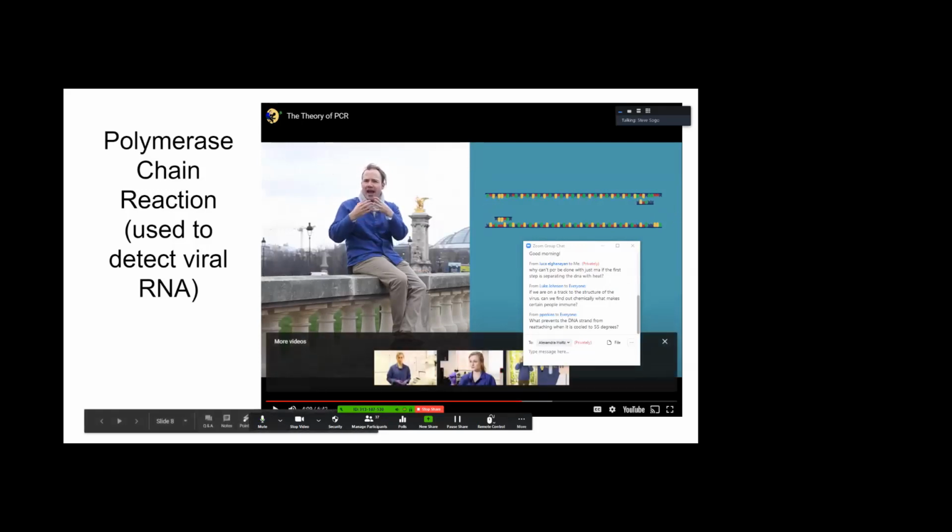Okay, so see, the primers are binding in the cartoon, but why doesn't this strand get back together with this strand? It can, but the way that the scientists make it unlikely is by flooding this reaction with primer. So there's maybe 1,000 times more primer than there are DNA strands. So then it's just probability.